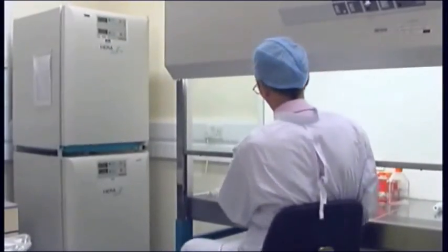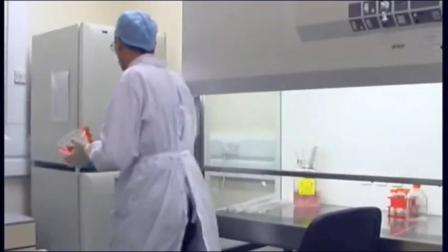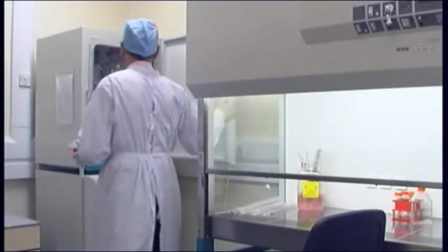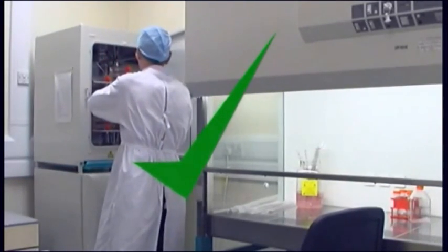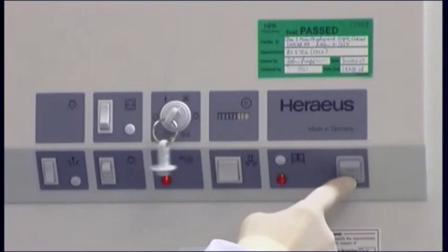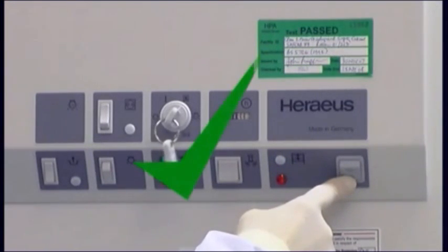On completion of work, remove all of the cultures for incubation after spraying their containers with 70% alcohol solution. Leave the cabinet on for 5 to 10 minutes before switching off. Alternatively, leave it running all of the time.